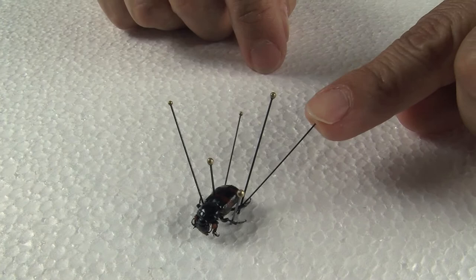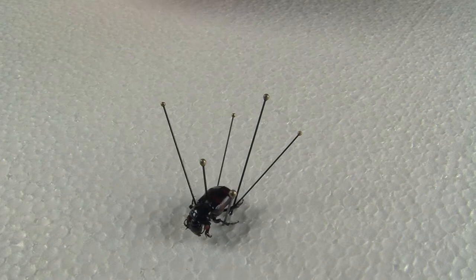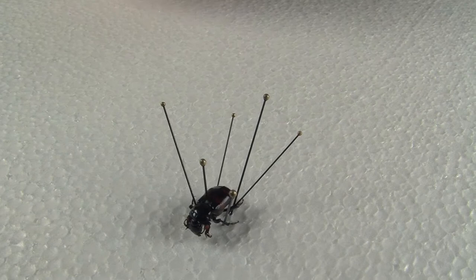After you pin your insect, make sure to keep it this way for at least 48 hours before you remove all the pins except the one in the center. Otherwise, the insect will go back to its natural form.